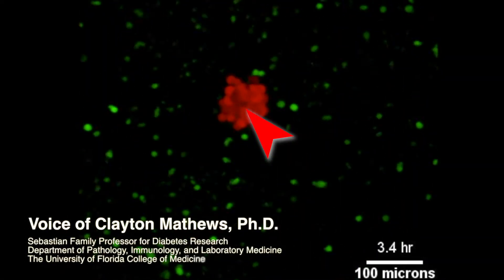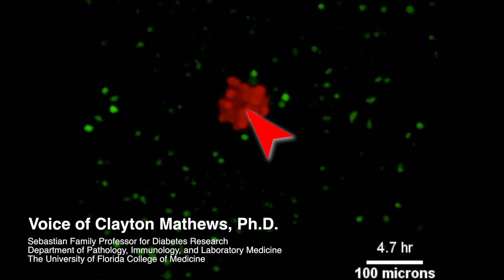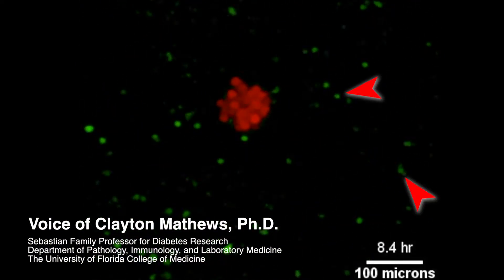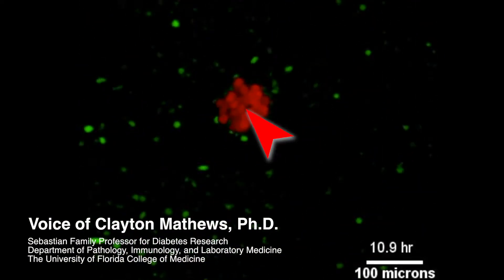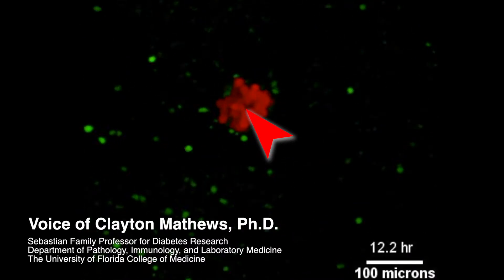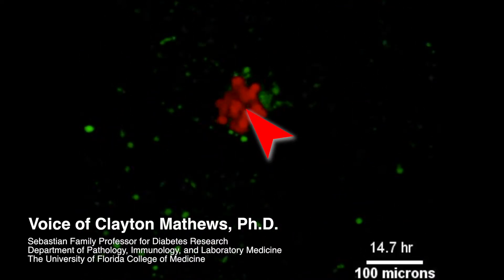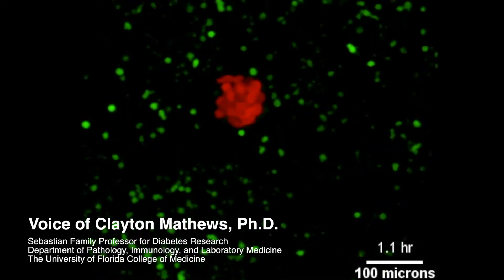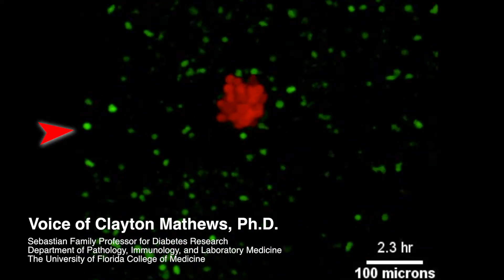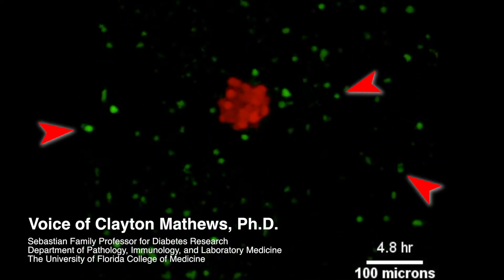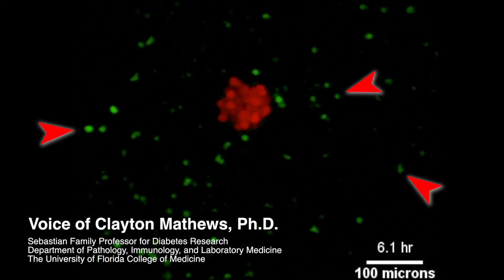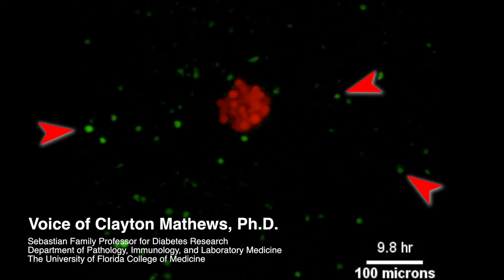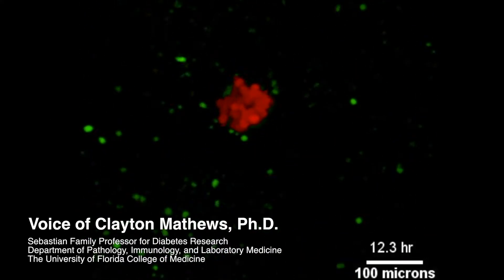Beta cells are in red — that beta cell cluster in the center — and the T cells are green. The beta cells are red based on a dye that stains healthy, living cells, and the T cells are green because they're expressing a bacterial protein, green fluorescence protein.